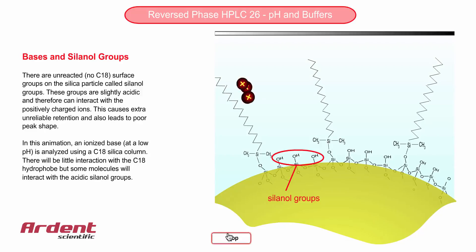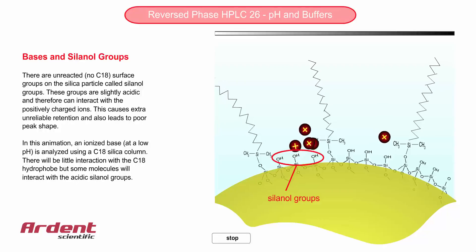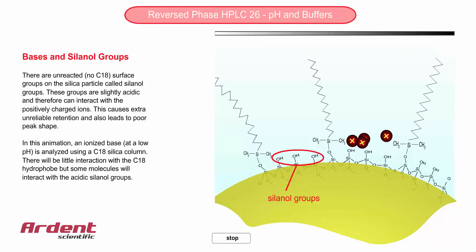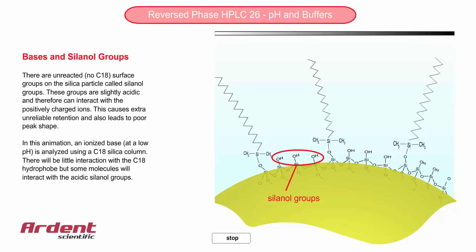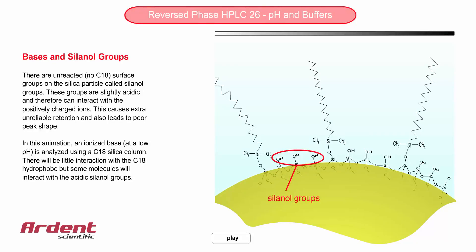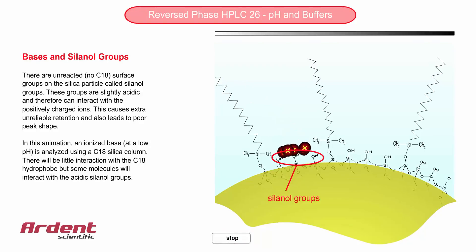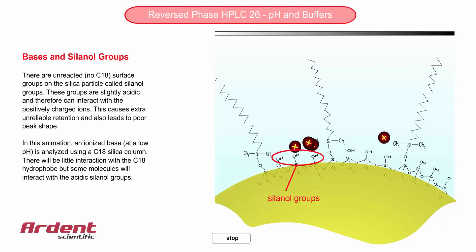As can be seen, this can slow down the progress of some of the molecules as they interact more with the silanol groups, and these slowed down molecules will elute slightly later from the column, resulting in a tailing peak.